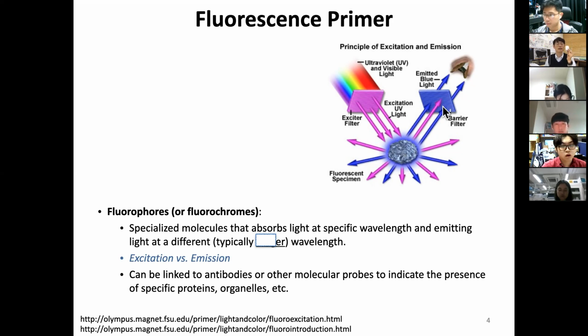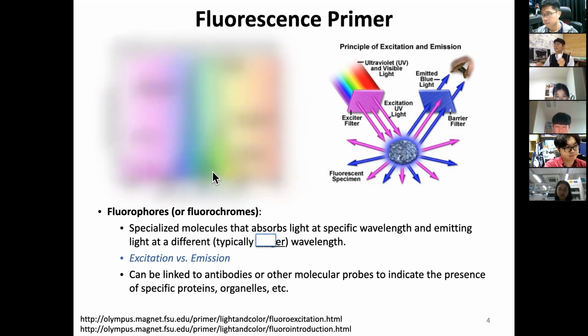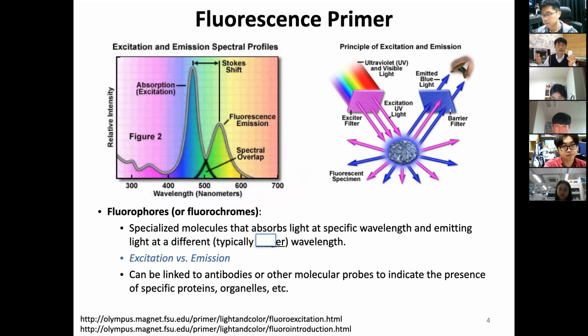And you can discriminate or distinguish the molecule or substance, which we call a fluorophore or fluorochrome, distinctly, and you can watch only this one. So how can you do this? Let's think about the spectrum. Let's say this specific stone, called a fluorochrome, chrome means color.